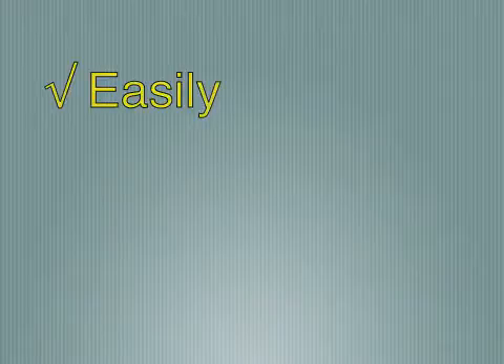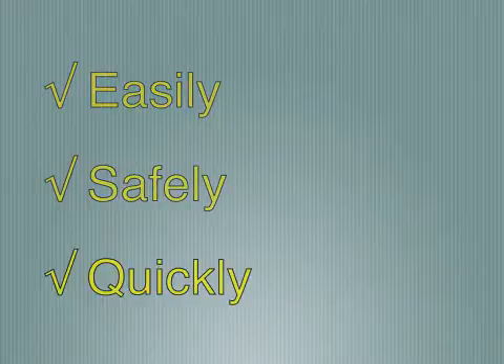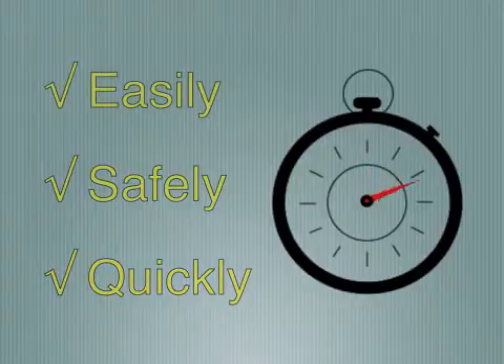Let's watch how easily, safely, and quickly this machine operates. An entire cycle, including cleaning, lasts approximately 90 seconds.